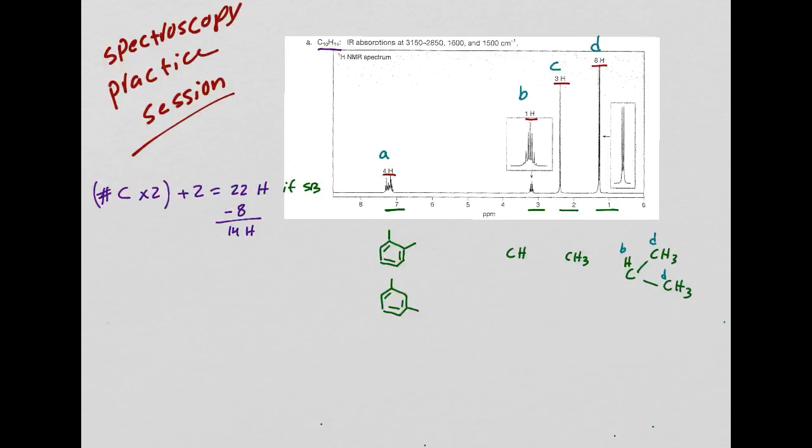Now what I'm going to do, I want to start counting carbon. That really helps. Remember, we have 10 carbons to account for. 1, 2, 3, 4, 5, 6. 6 carbons are going to be in a ring. 7, 8, 9, 10. Okay, so I have all the carbons, 6, 7, 8, 9, 10. So I have all the pieces of information that I need. So all I have to do now is to put them together. How can I put this together?